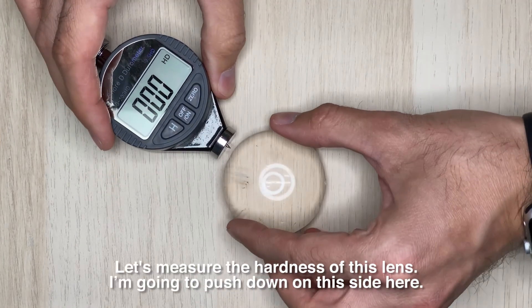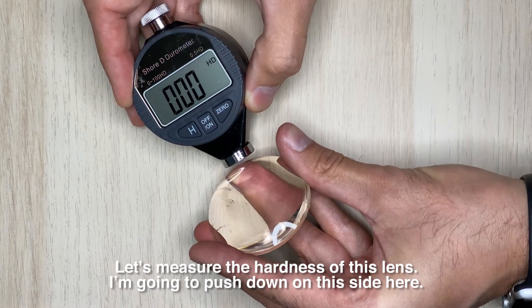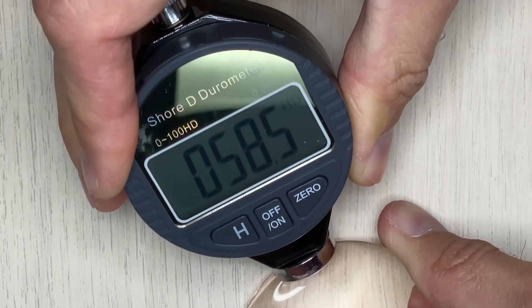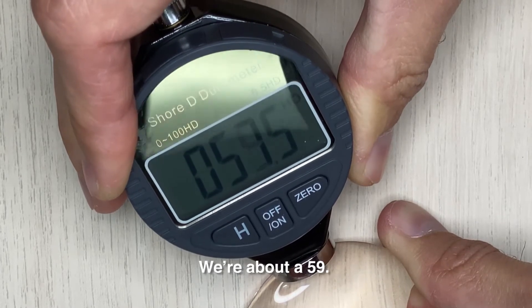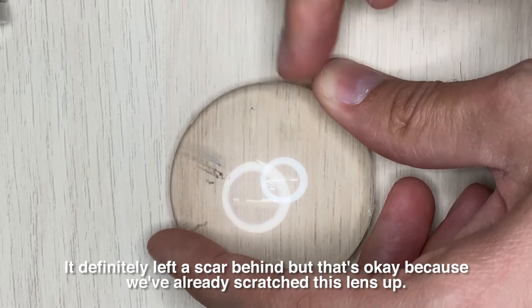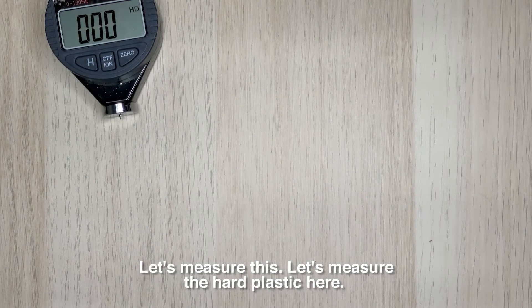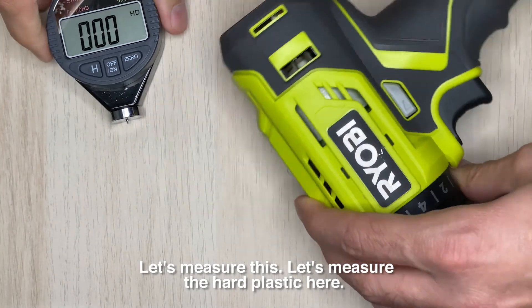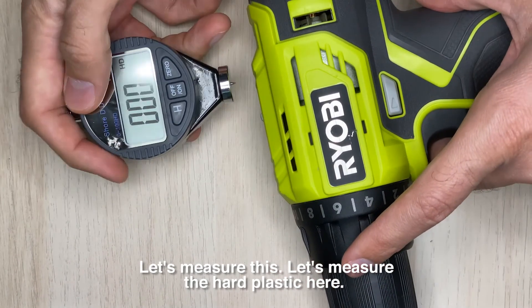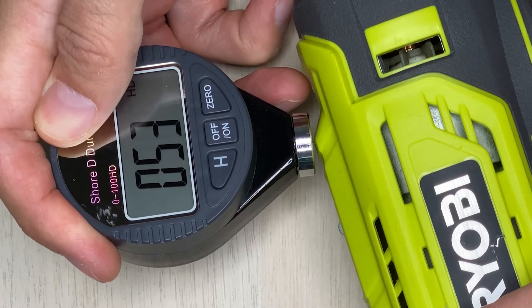I'm going to push down on this side of the lens here — we're at about 59 Shore D. You can clearly see I left a scar behind, but that's okay since this lens was already scratched up. And measuring the hard plastic here gives us about 53 Shore D.